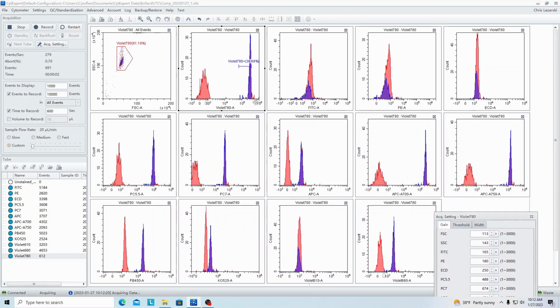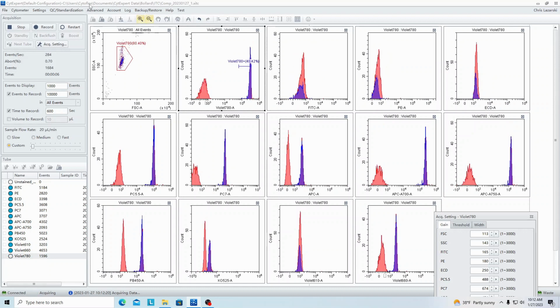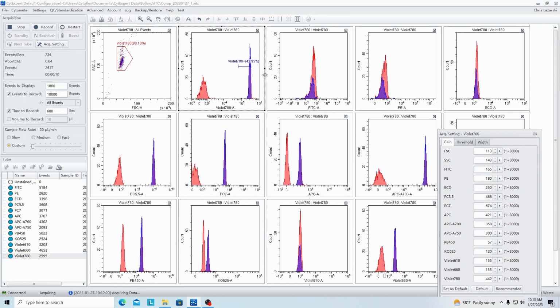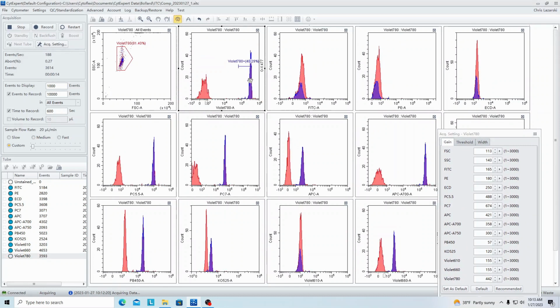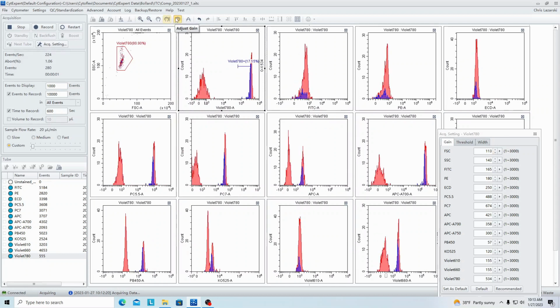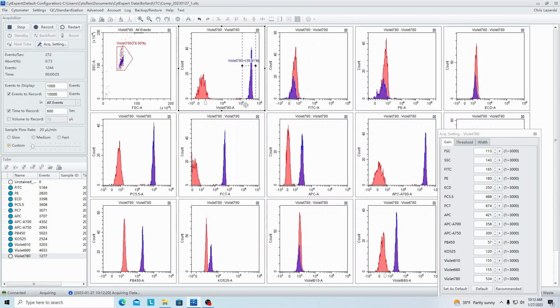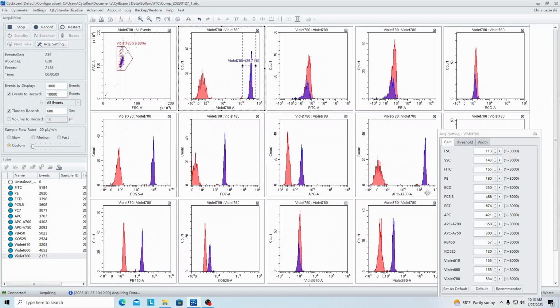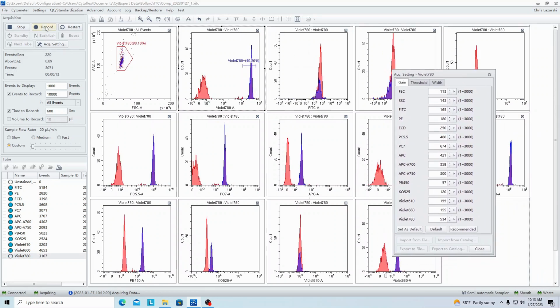So we can see here that this is now at 2 times 10 to the 5. This is still pretty close. How did that adjust it? That increased it to 400. You want to pull that maybe a little bit more positive. 500. 1, 2, so we got 3. This is at about 1.5. That's at a little below 1.